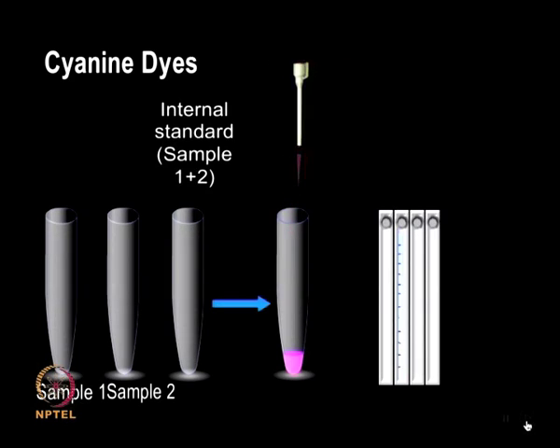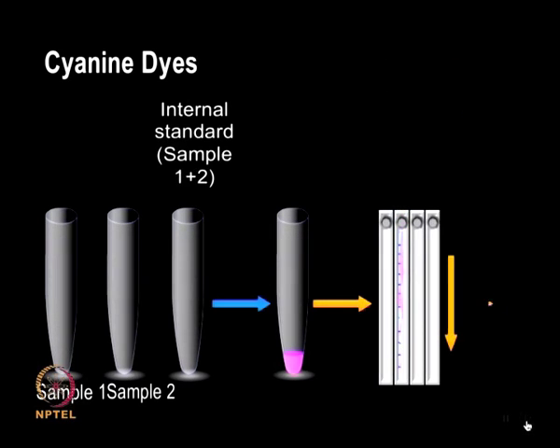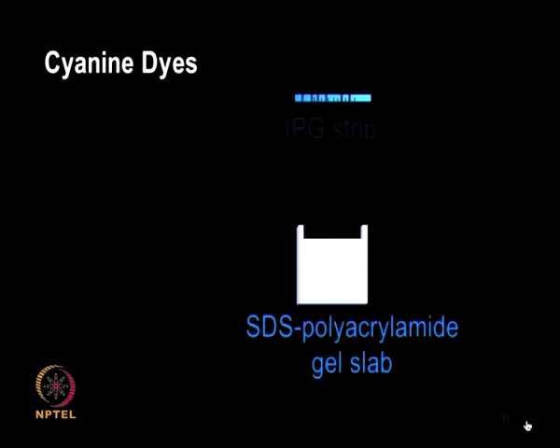After dye labeling and mixing all the samples together, the isoelectric focusing can be performed, followed by the second dimension separation in SDS-PAGE.